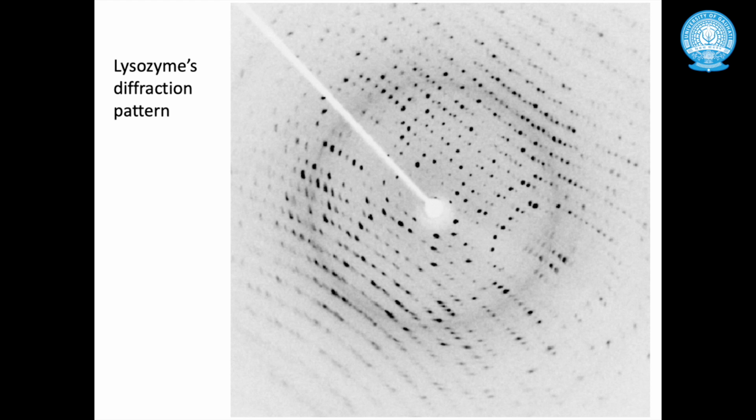All these dots are combined together, and in order to solve the phases of these dots, we need a lot of background information, right from biomolecular spectroscopy data to HPLC data, their possible structure, their mass, and many other things, functional groups which we identify with the help of instruments like infrared spectroscopy.